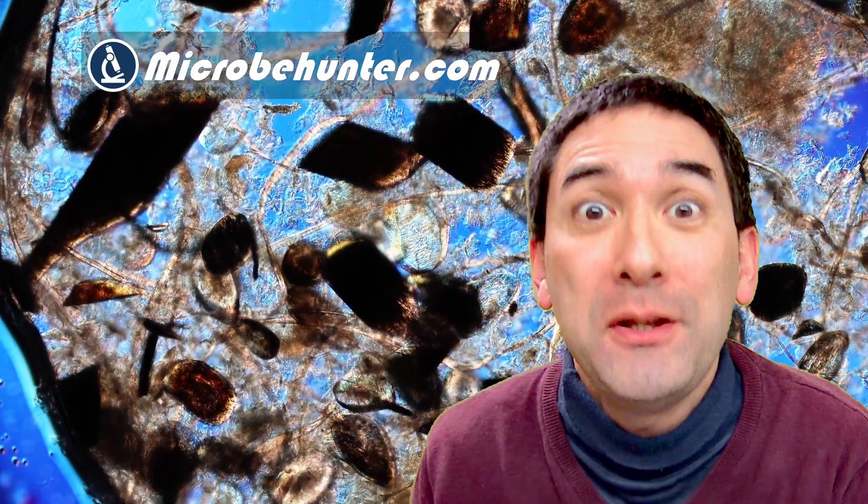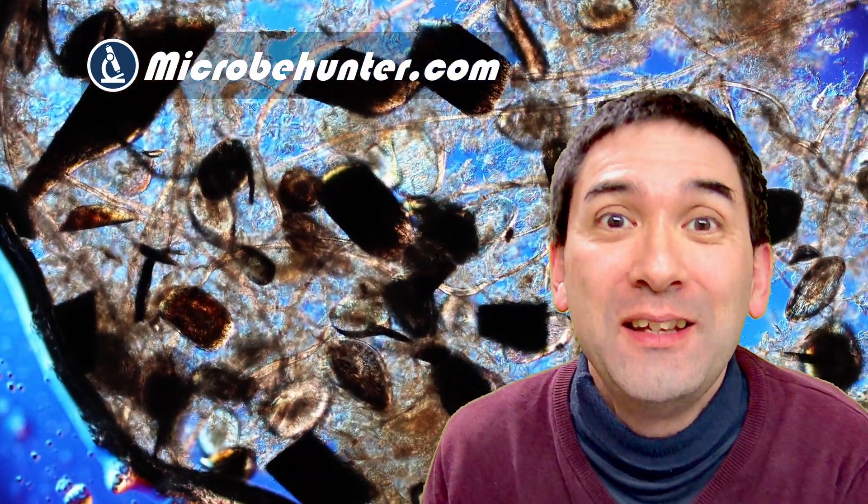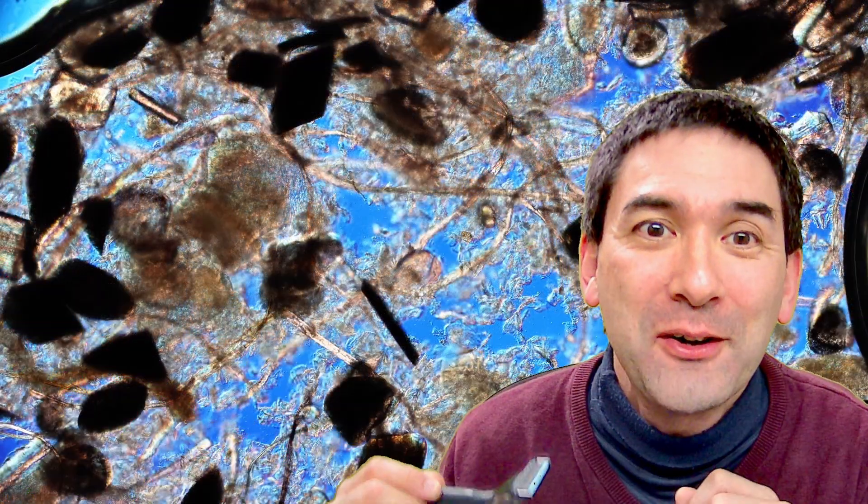You're looking at my beard. Yes, you heard correctly. These are beard clippings. I shaved myself using a razor and then I put the little pieces of hair under the microscope and I found something quite unusual and maybe even a little bit surprising in the sample.